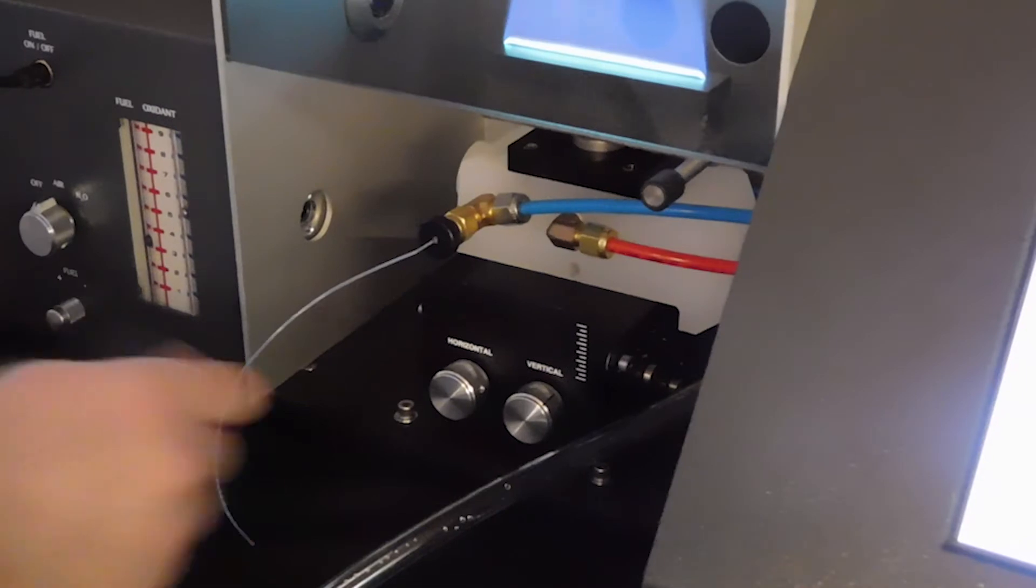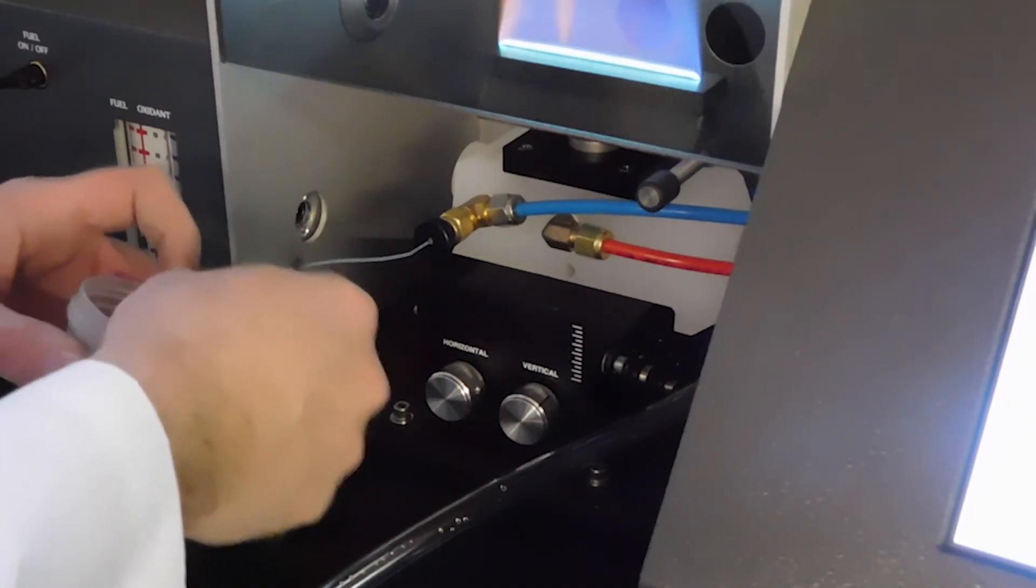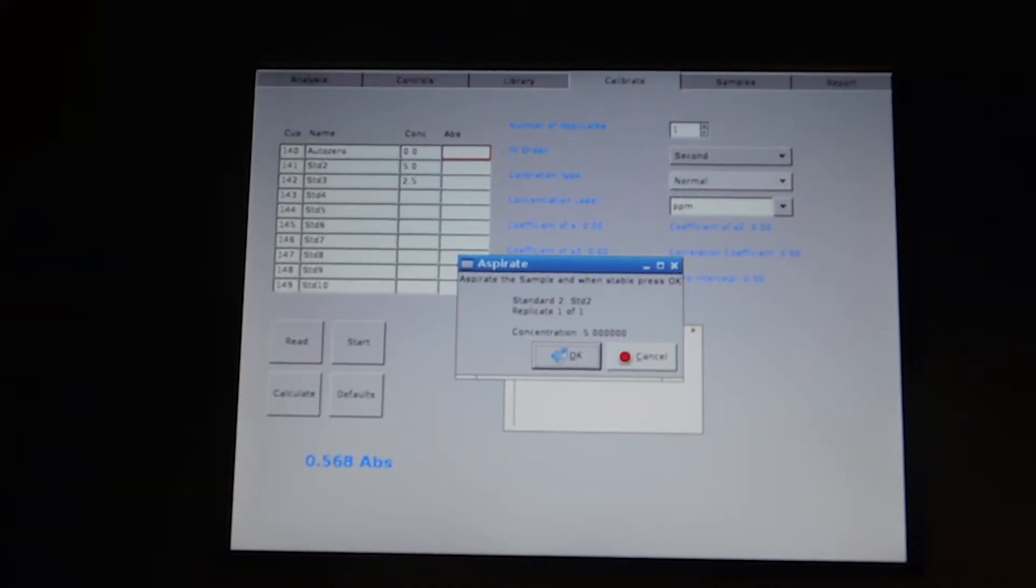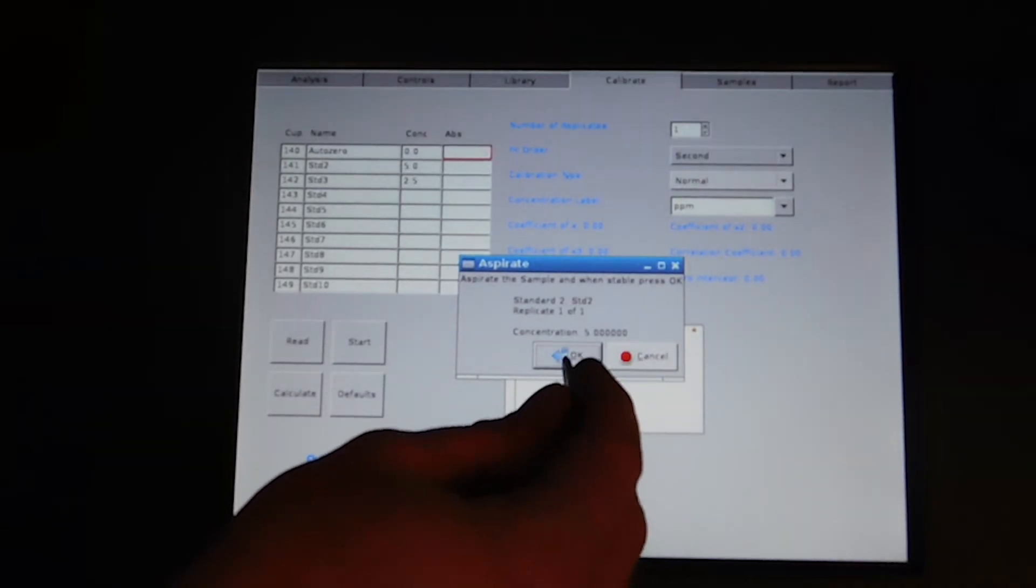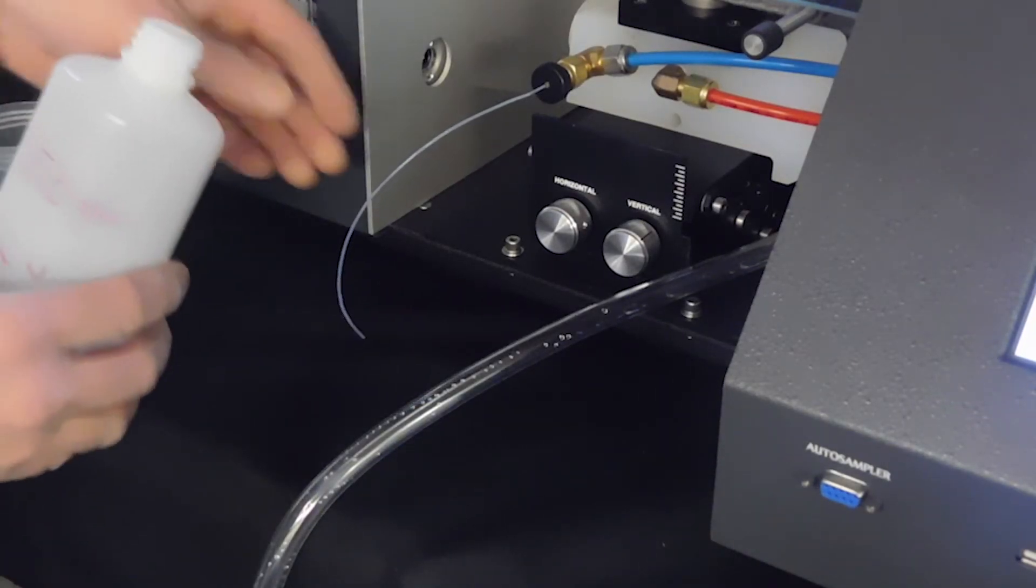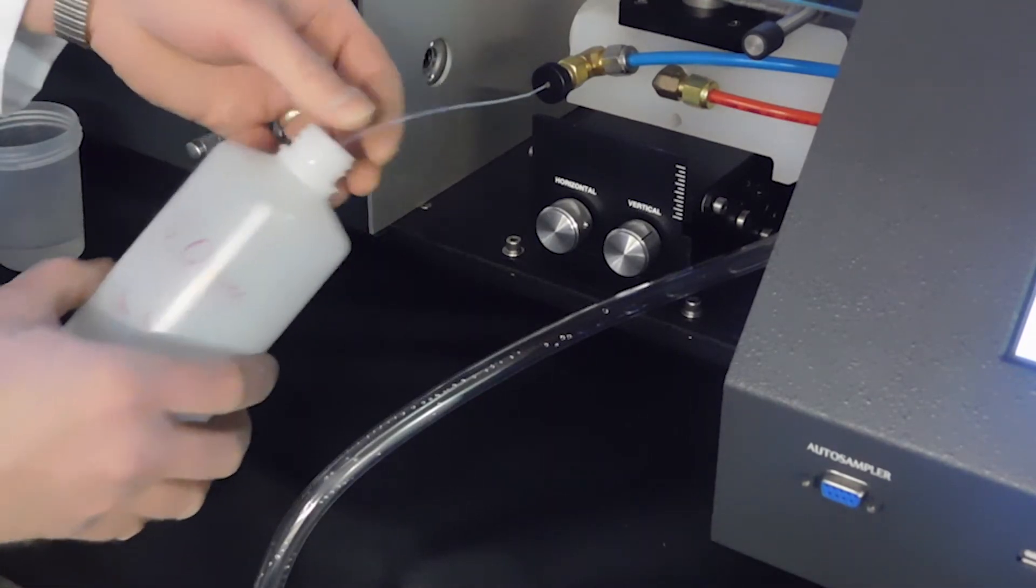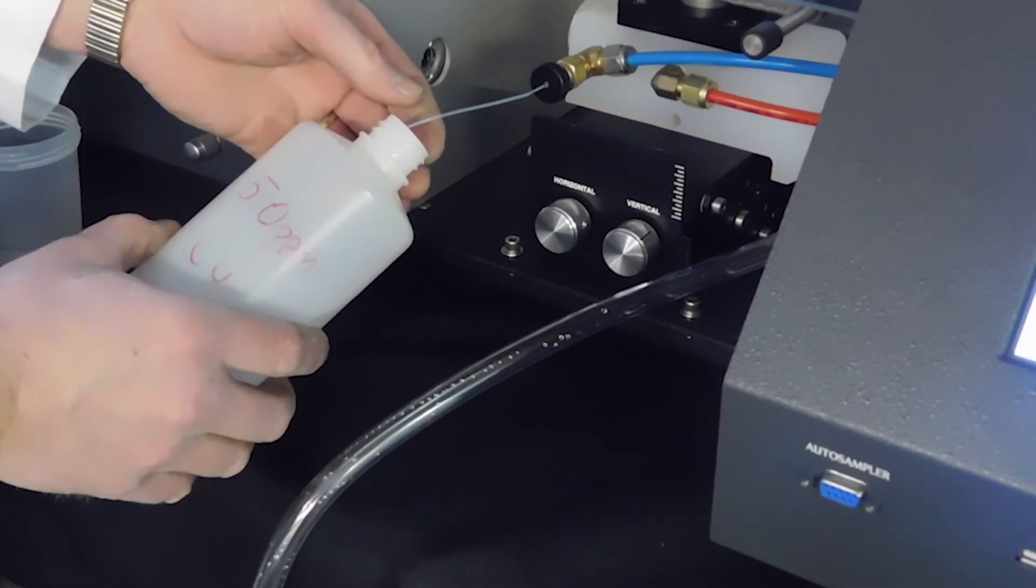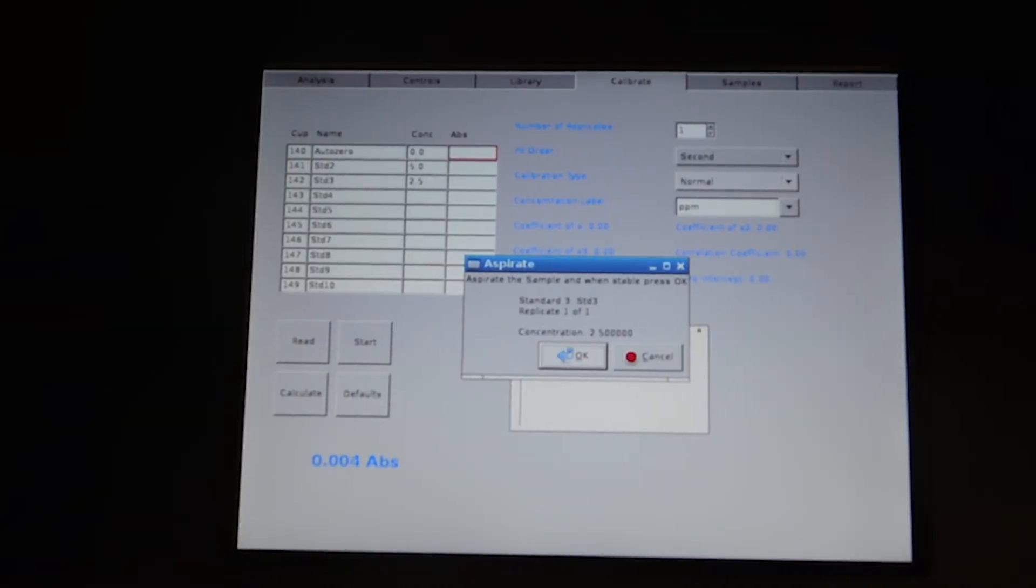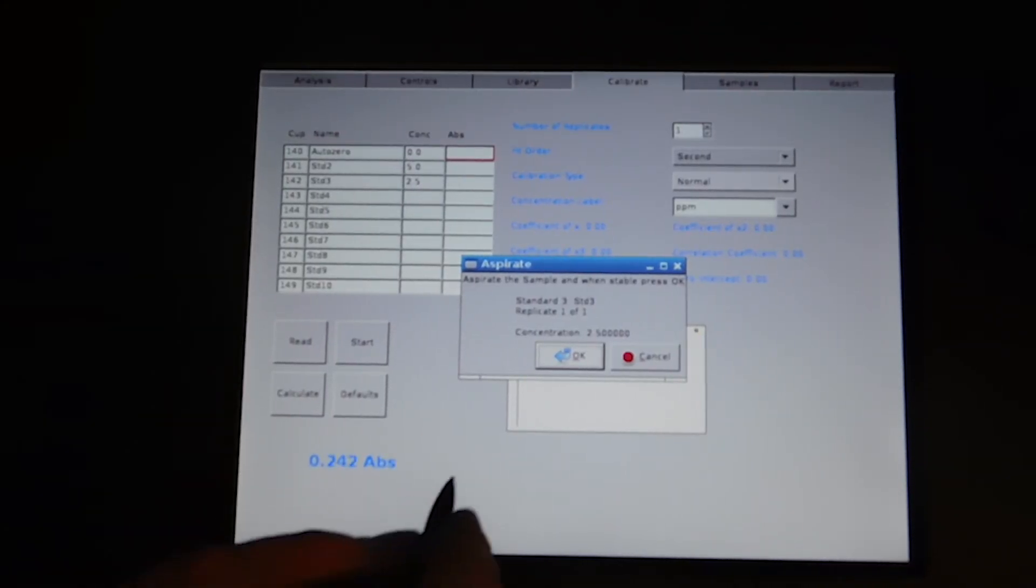Next is standard one, replicate one. Next is our five ppm standard. And then our two and a half ppm standard.